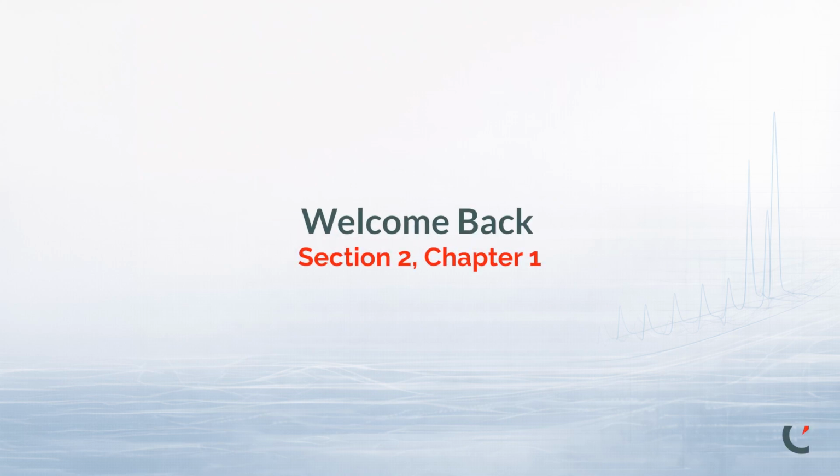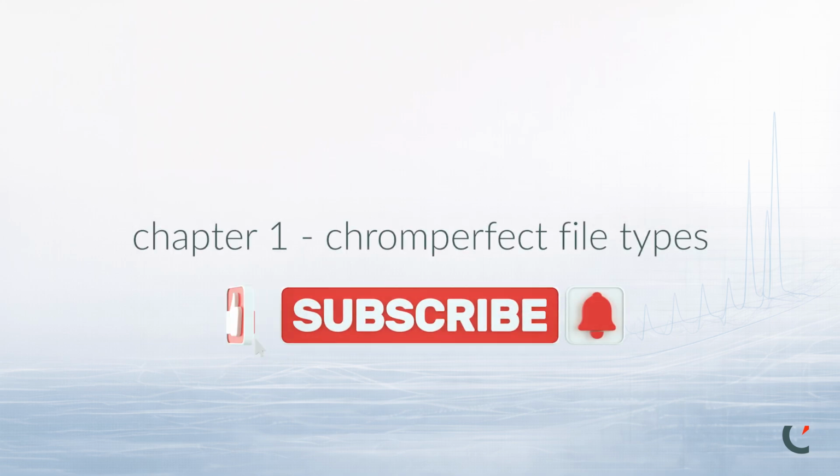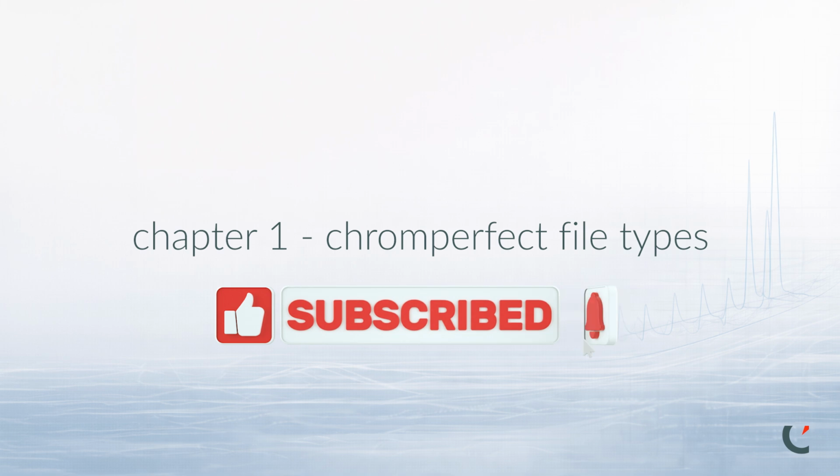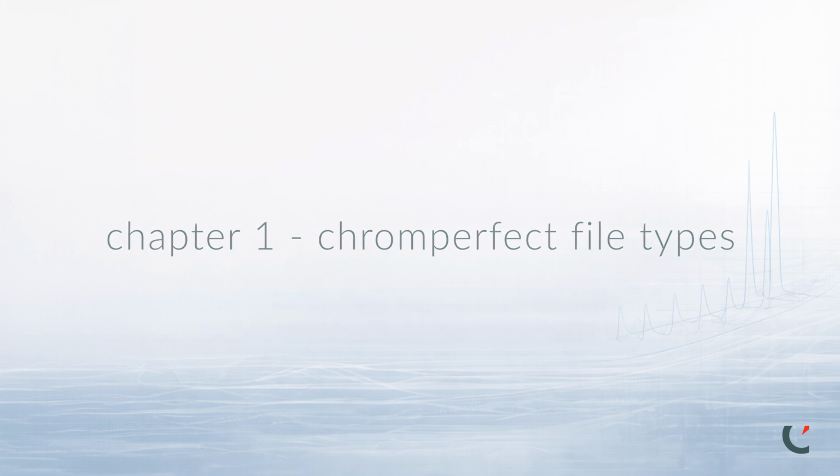Chromperfect, Beginner Training Series, Section 2, Chapter 1, Chromperfect File Types. In this chapter, we will introduce the core file types used in Chromperfect and explain how they relate to acquisition, processing, archival control, and output generation.